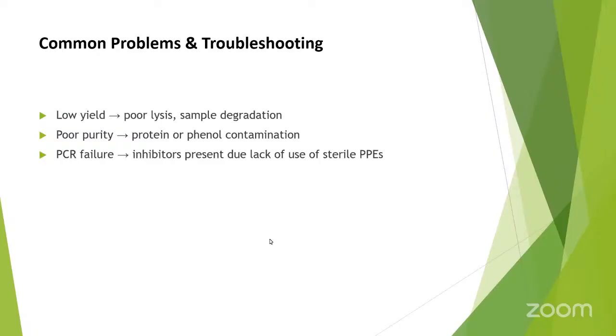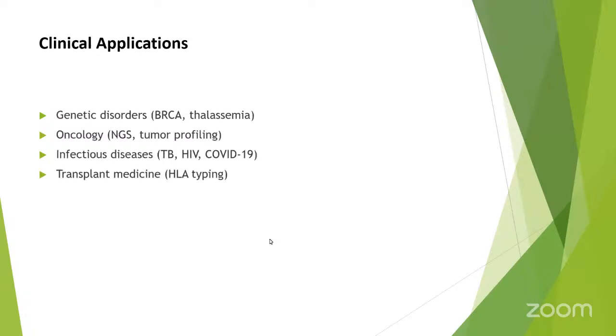In most cases, it is recommended that when doing extraction, people should be using sterile PPEs. For example, powder-free gloves are mostly recommended, and also ensure that while performing all these tests everything is done under the biosafety cabinet.